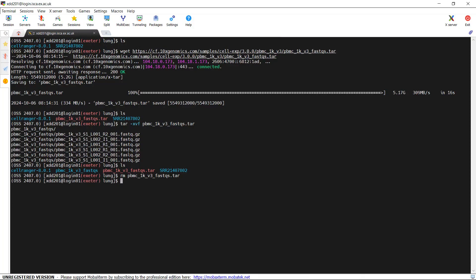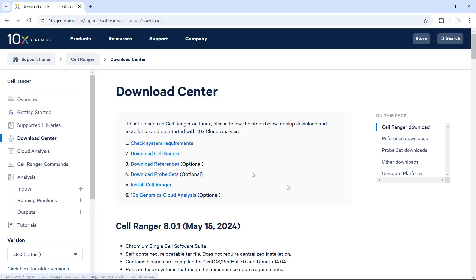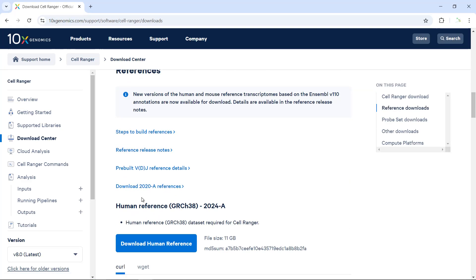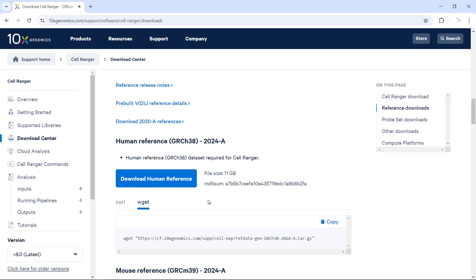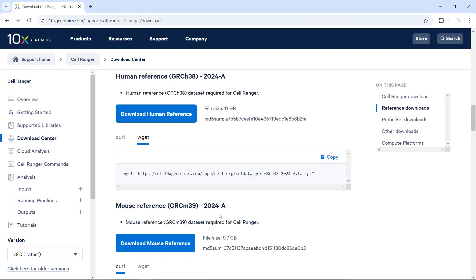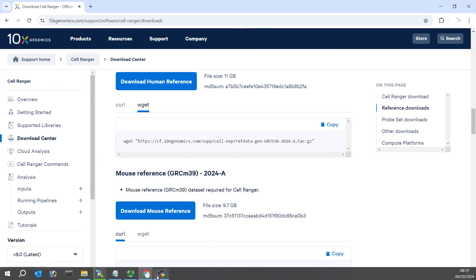Now we have the raw sequencing data. Next, we need to download the reference file. Because the cells in the PBMC data are human cells, we need to download the reference file for the human genome. We can go to the 10x Genomics website again and go to the download center, where we can download the references. You can see the human reference — GRCh38 2024 — listed there. We can use wget to download the human reference. If you are using mouse data, you can download the mouse reference instead.